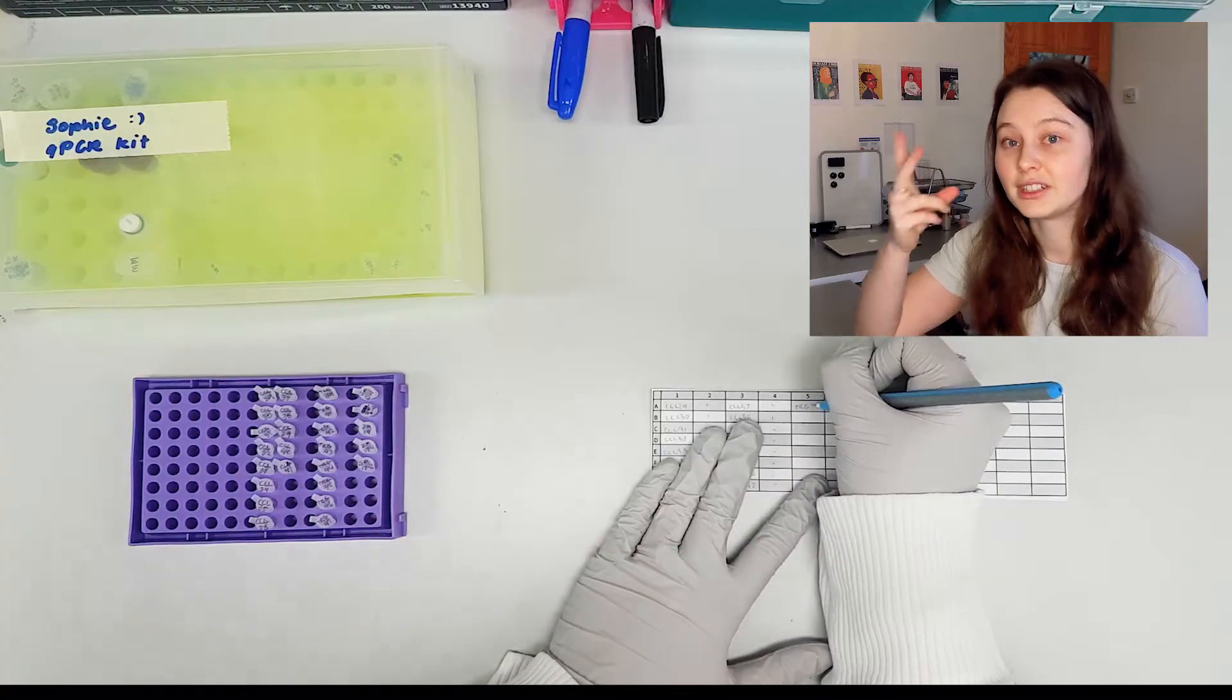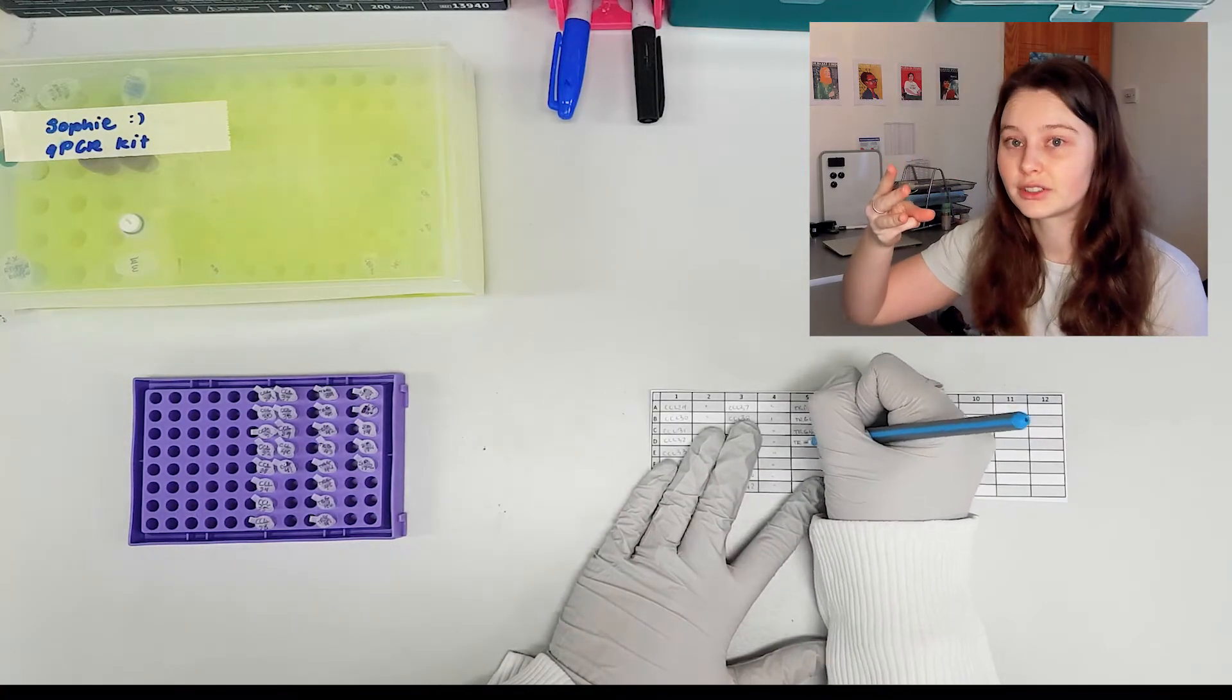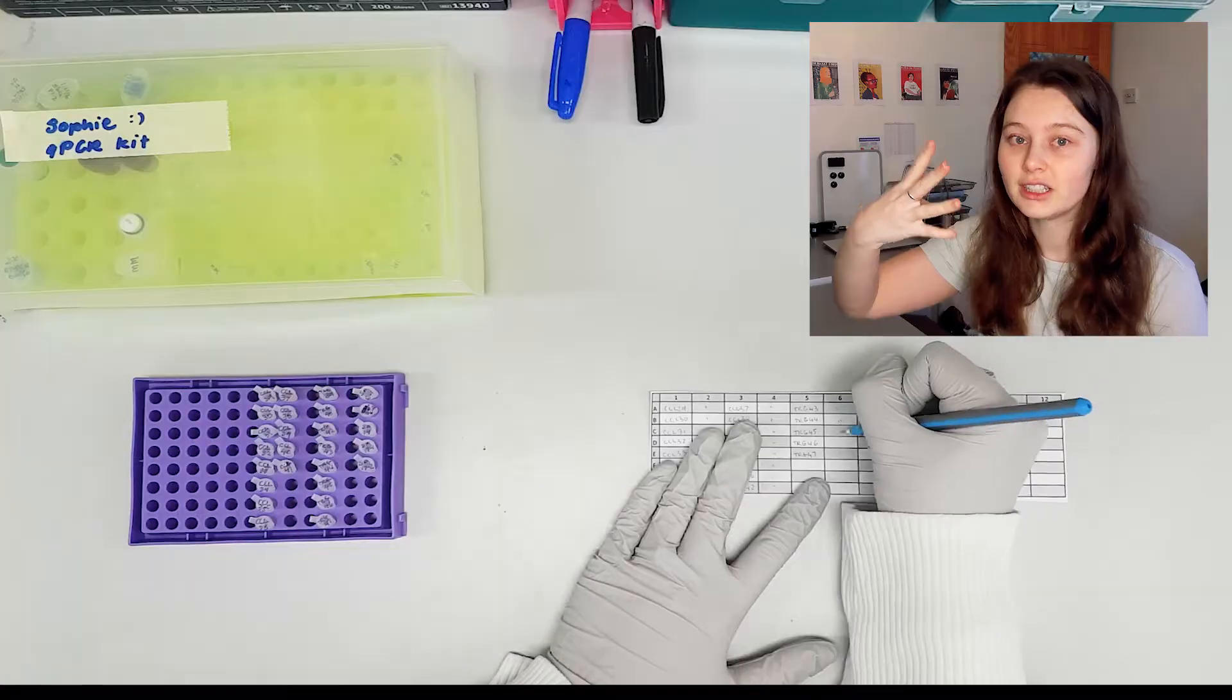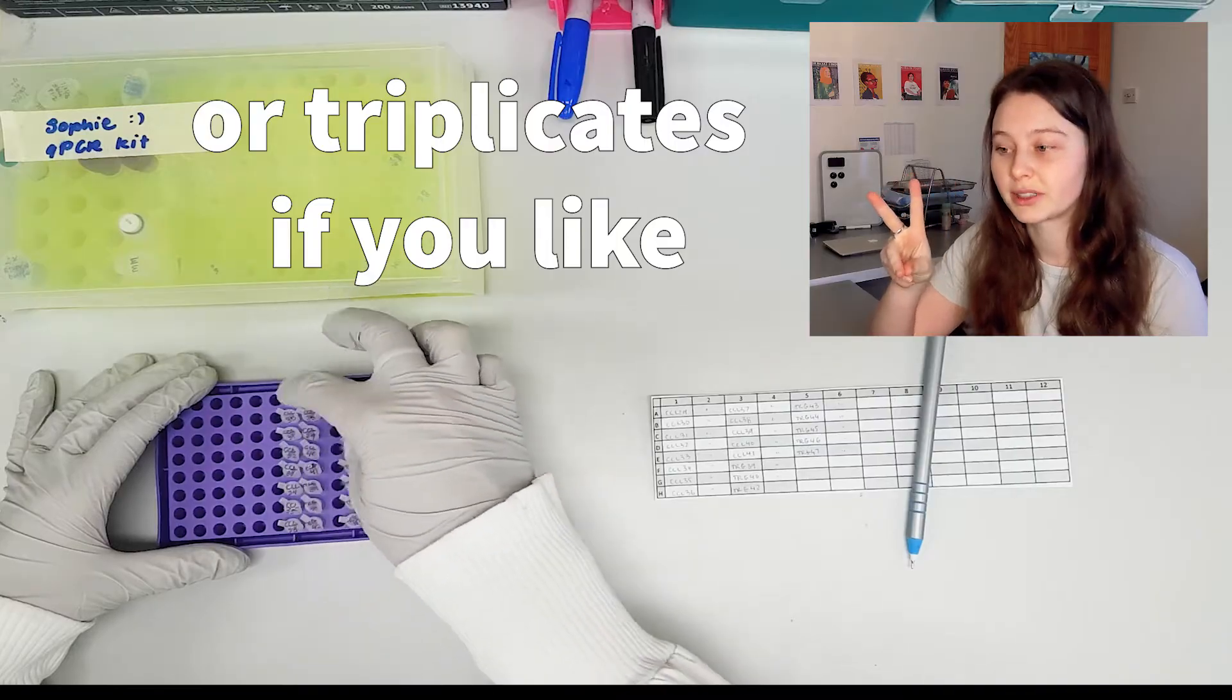the second thing is your negative template control, third thing is your positive controls, and then fourthly you need to double all of that because you're going to do technical duplicates.